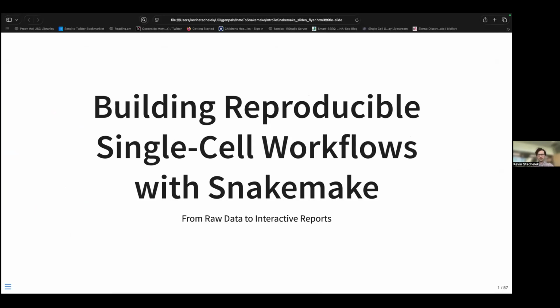My name's Kevin. I work in the Genomics Research Technology Hub over in Sprague Hall. I started in August. Been here a couple of times for these meetings, but excited to talk today about building reproducible single-cell workflows with Snakemake, and hopefully it's applicable for anyone who wants to use Snakemake or workflow management systems in general.